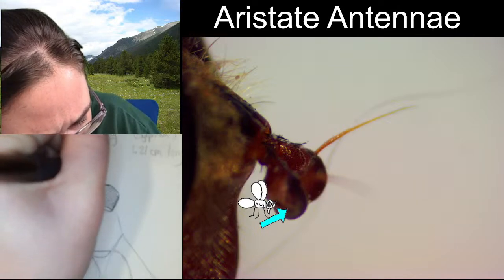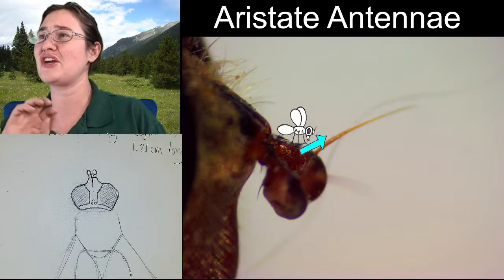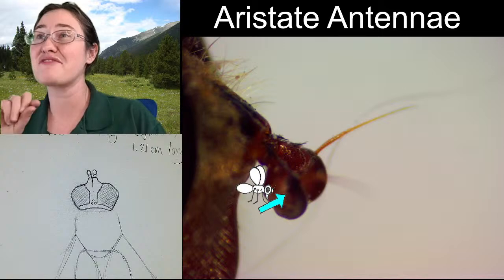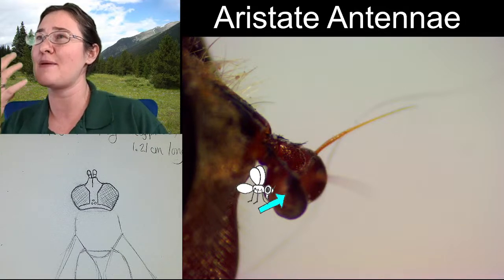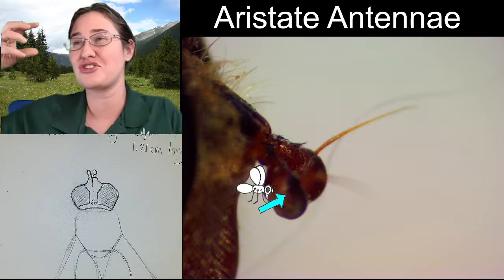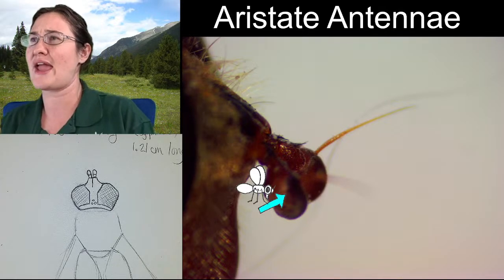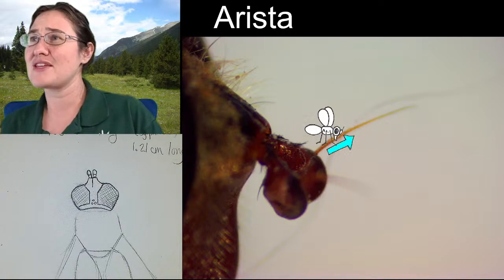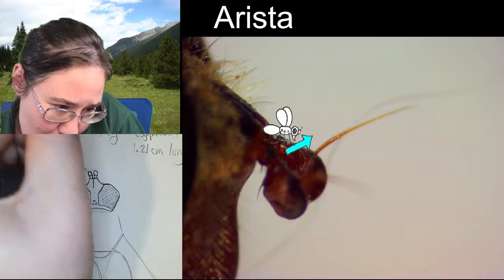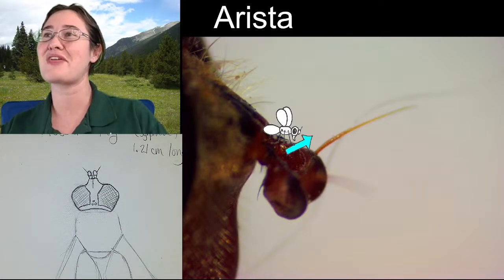And these are what we call aristate antenna. Now, funny enough, there's a reason for that. You see this hair here. It's a very strong hair coming off of the antenna. All aristate antenna have that little hair. Some of them are really big and fluffy. Like, I have a green bottle fly sitting next to me that the hair on the aristate antenna looks like a really big feather. It's really beautiful. This one is more like one stray hair. But that hair has a name. This hair right here is what we call the arista. That's where the aristate antenna get their name from. They get their name from that little hair on it.